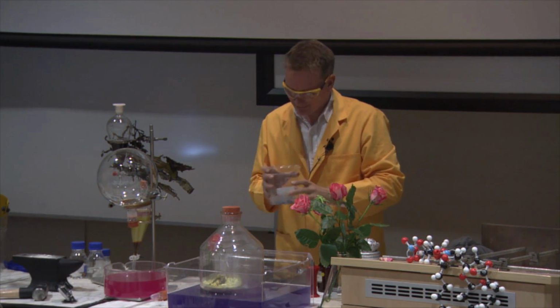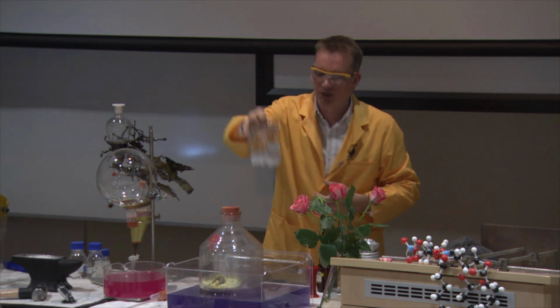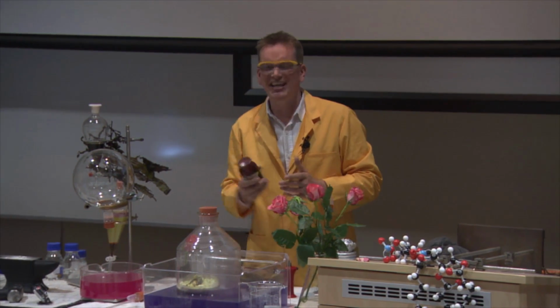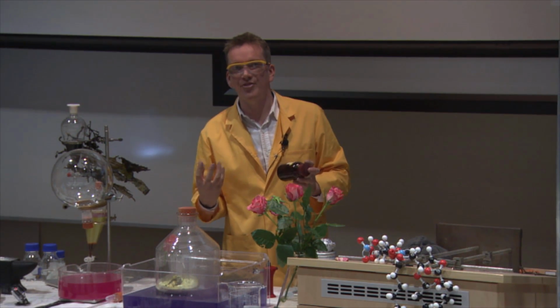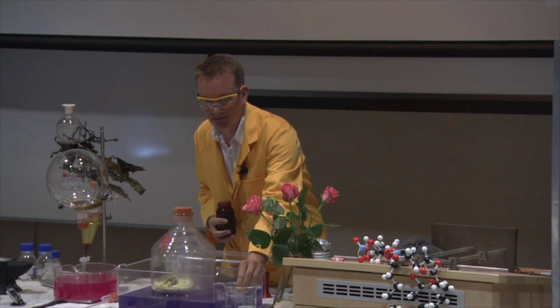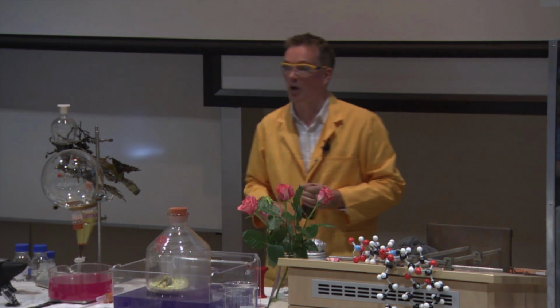And, well, if this was fresh calcium metal, it would have already begun to react, but it's taking a little bit of time. We'll just leave it there. This is taking a little bit of time because it's so old. And this is because, well, over time, calcium metal reacts with oxygen from the air, and it would form calcium oxide. There's still some calcium metal left, and that is now beginning to react with the water as well.